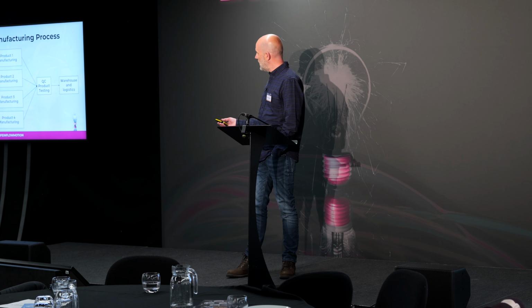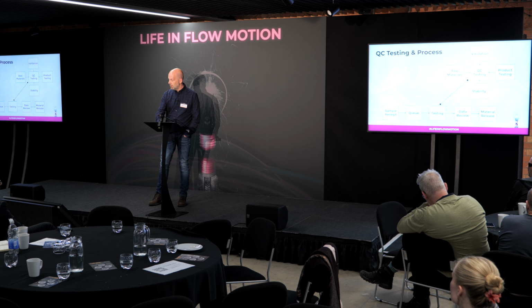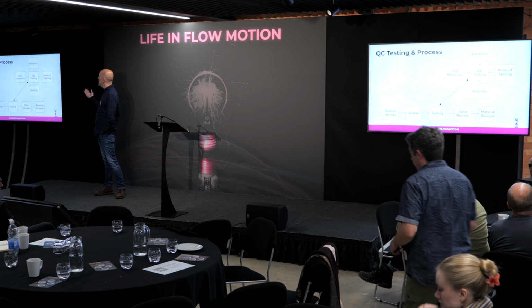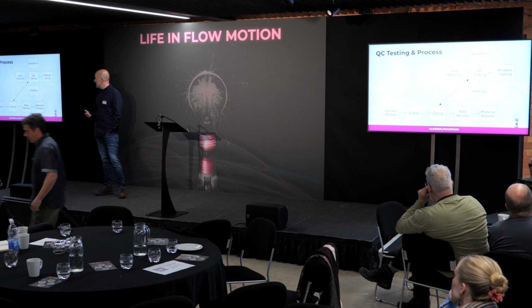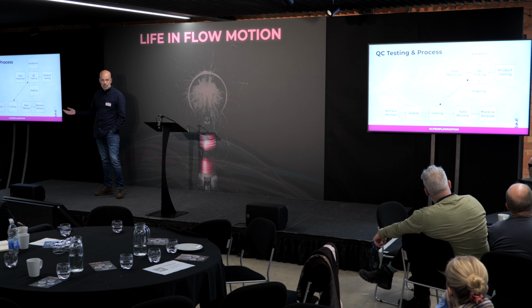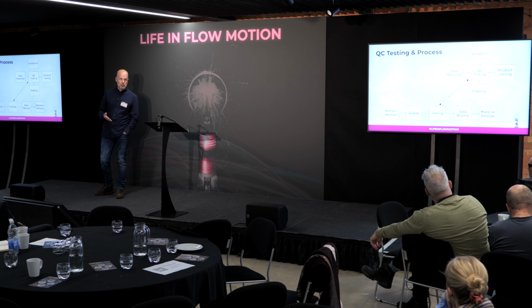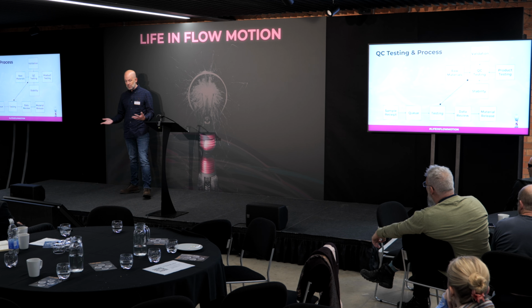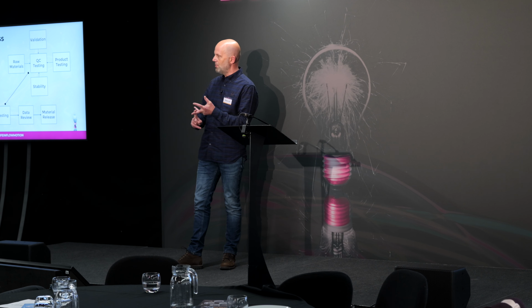So when you look at the QC team, you've got your raw materials coming in, you've got your product going out, you've got validation samples, and you have a regulatory requirement to revalidate, and then you've got stability testing. So if you make any changes to your pharmaceutical manufacturing process, then you have to put stability samples down. So to the uninitiated, you have to put 3 batches down per year anyway, which is samples are kept at 4 degrees, 25, 60, and 40 degrees, 75% relative humidity.